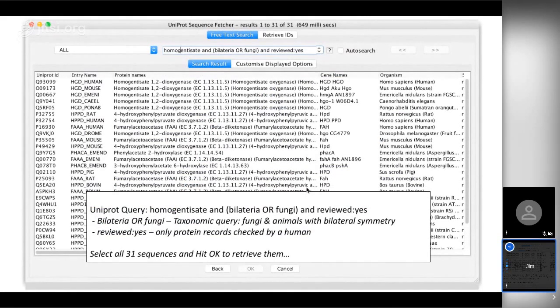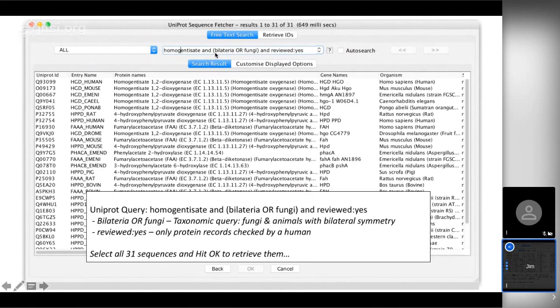This is what you get when you query Uniprot from Jalview — a dialog box that opens when you select the Uniprot option from the database chooser. I've entered a query for homogentisate dioxygenase, which is the gene we were looking at earlier. There are very few genes which work on this particular compound, homogentisate. I've also put in a structured query to limit the results from Uniprot to just genes found in Bilateria — the animal kingdom with bilateral symmetry, as opposed to things like starfish which have rotational symmetry.